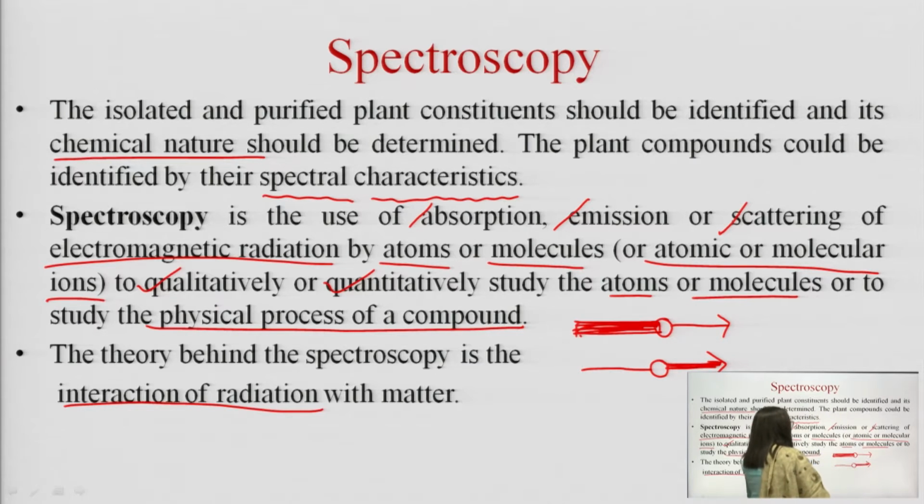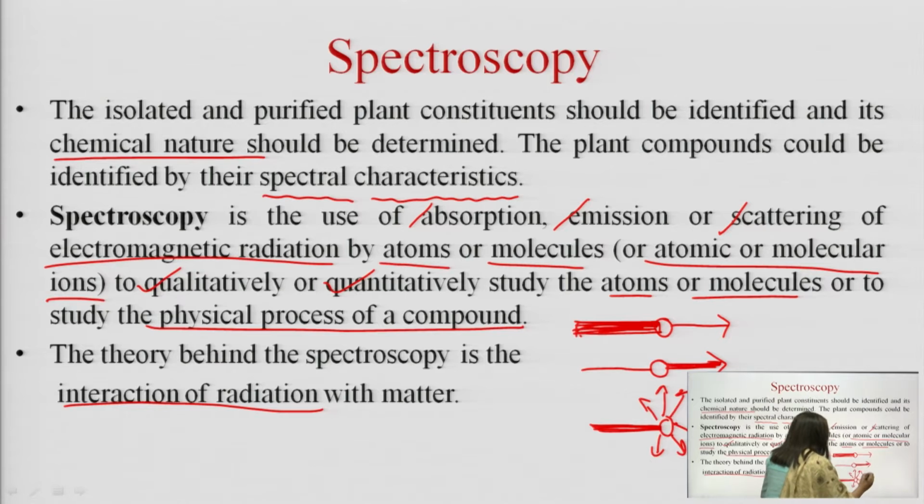In case of scattering, the electromagnetic radiation entering the sample would emit either outward scattering of the light or inward scattering of the light.